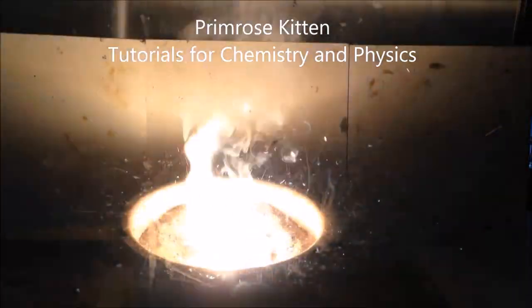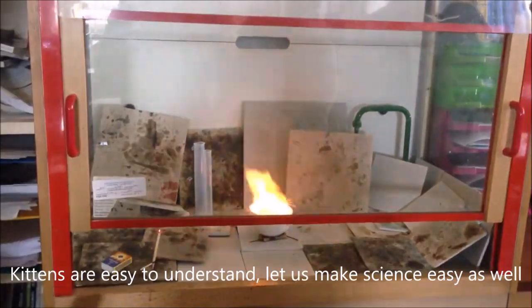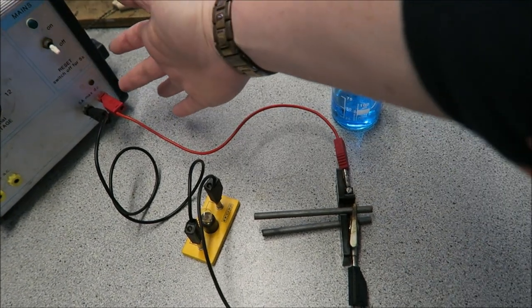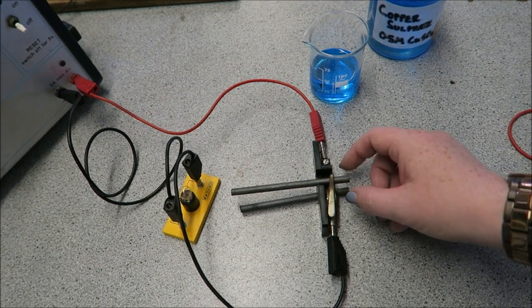Hey guys, today we are in the lab looking at electrolysis of copper sulphate. Here is what we need for electrolysis. We have our positive terminal here connected up to a graphite electrode.